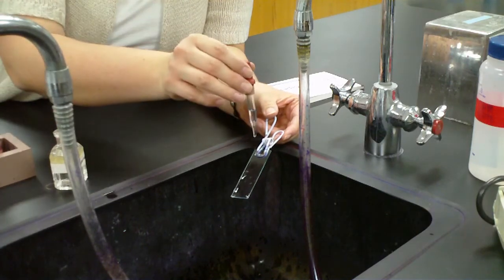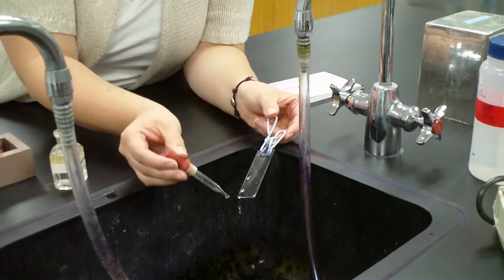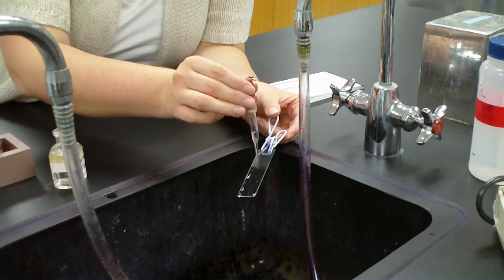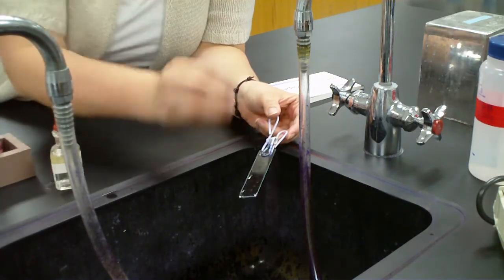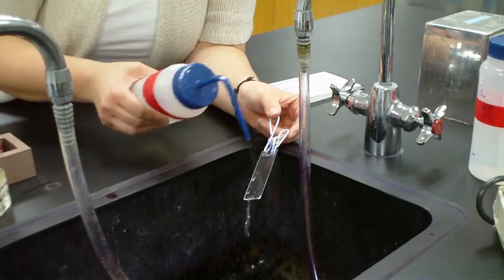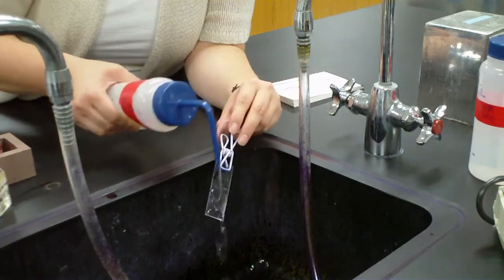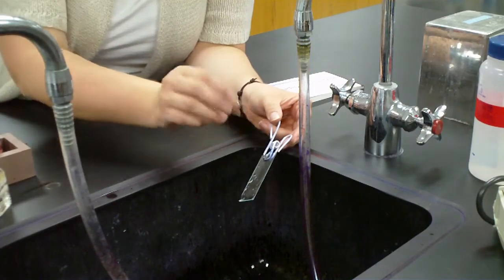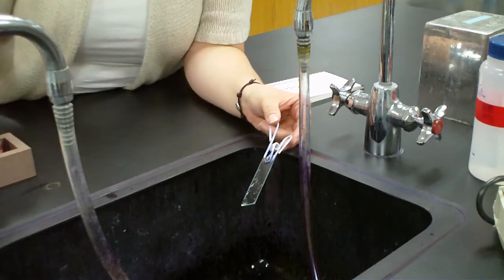and I'm going to drip decolorizer across my smear and as the drip comes off the corner right there, I watch for it to go kind of a light lilac purple. As soon as it hits kind of a lilac purple, because it'll be dark purple at the beginning, once it hits a light purple, kind of lilac color, I rinse quickly with my water. So I don't let the decolorizer sit for too long, and I let it drip pretty quickly as we're doing our staining.